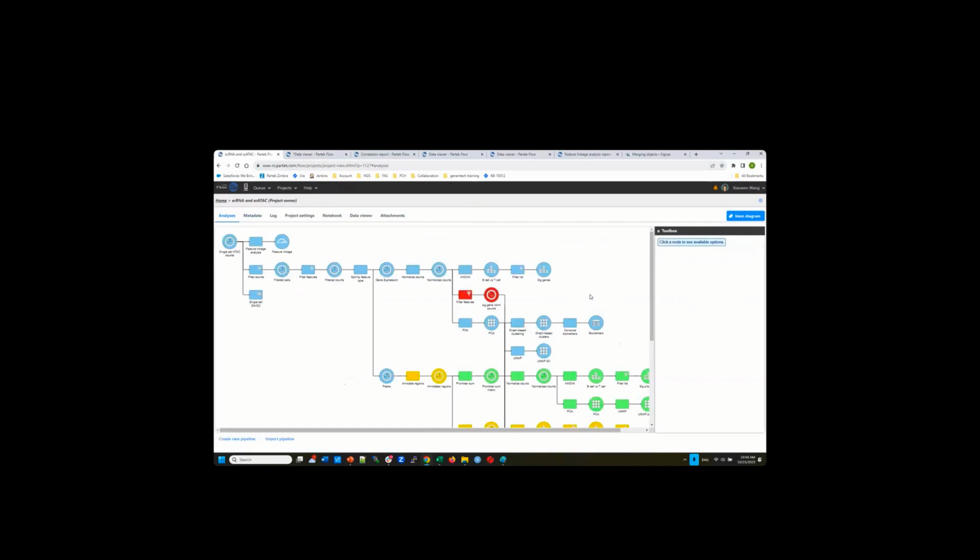Another thing is, just for visualization purposes, we take the Cell Ranger output result. Currently, Partek's chromosome view is not available to visualize the count matrix yet. We are going to add that. Our chromosome view is mainly only for BAM files, but when we import Cell Ranger output, we don't need a BAM file, but we're going to add more visualization in our chromosome view. But in the meantime, you can use Cell Ranger's output, the linkage analysis, to visualize how the linkage is going on.